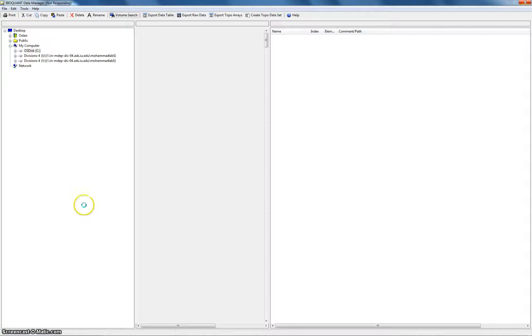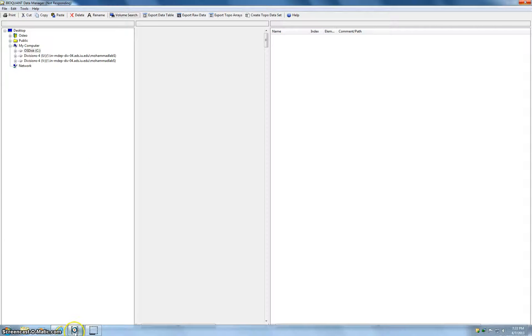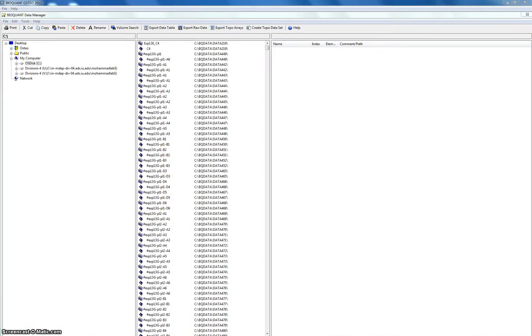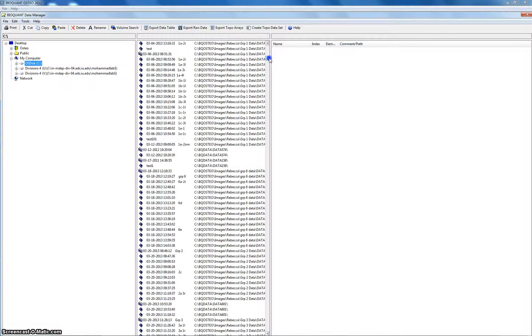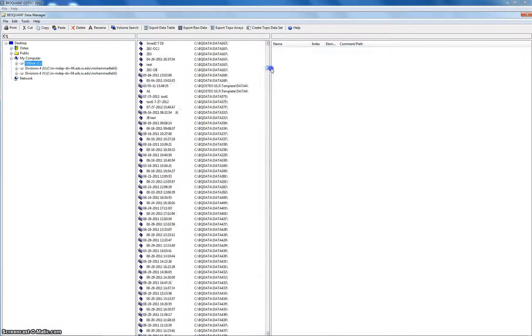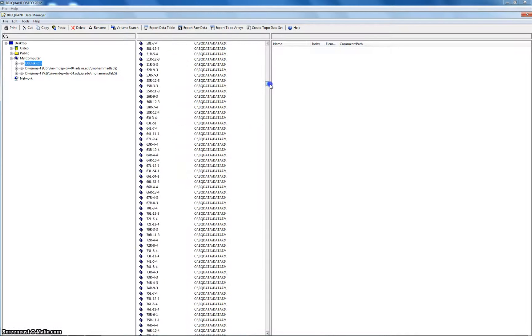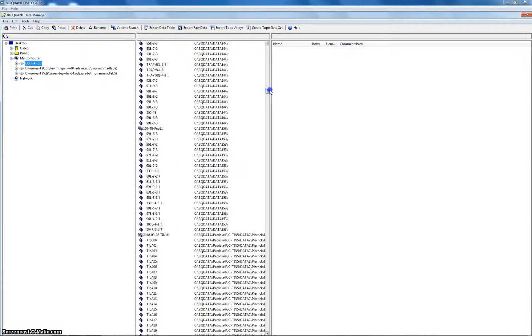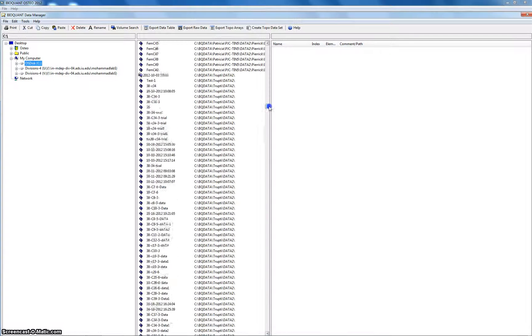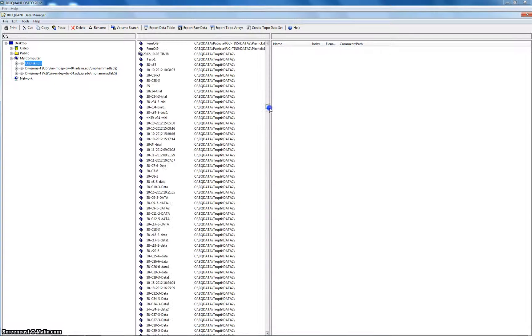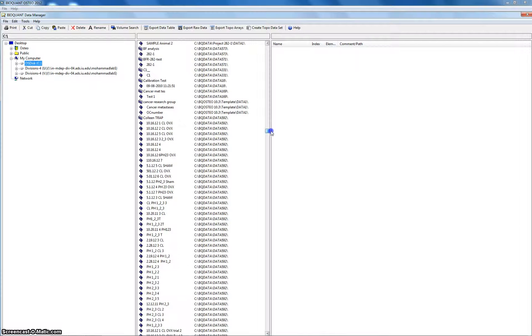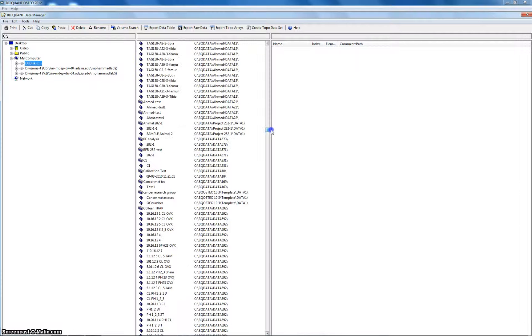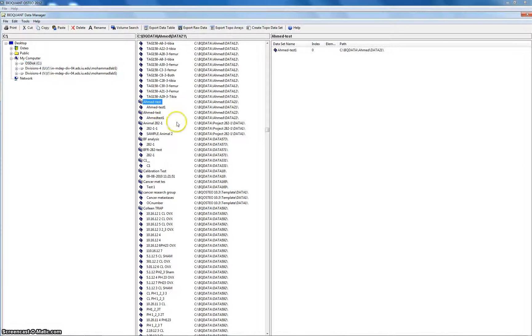It's still searching. Now that's what we got after like two minutes of waiting. So now you want to look for Ahmed test, which is our set. So this is the Ahmed test. That's it.